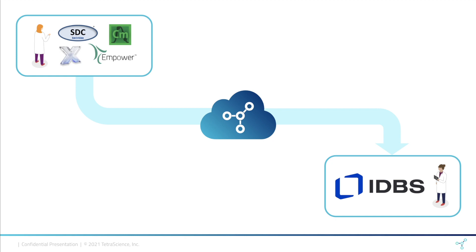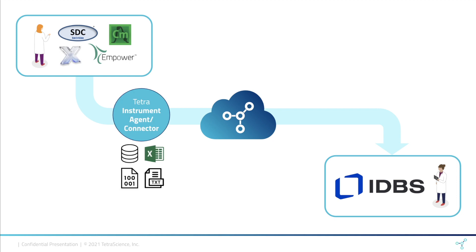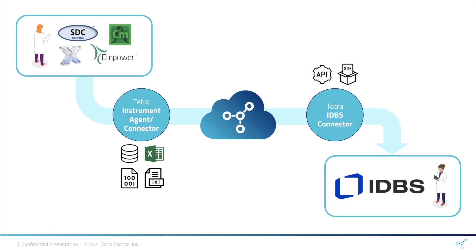Using our library of instrument and data connectors, we can retrieve experimental data from a wide variety of instruments and systems and pull it into the Tetra data platform. Then, using our IDBS eWorkbook connector, we can upload that experimental data into the notebook. Let's take a quick look in a little more detail.